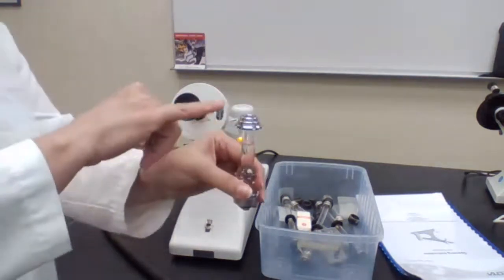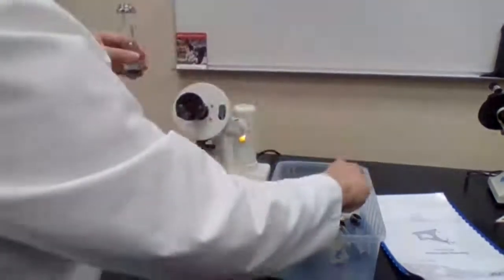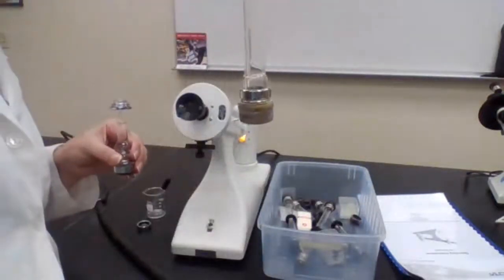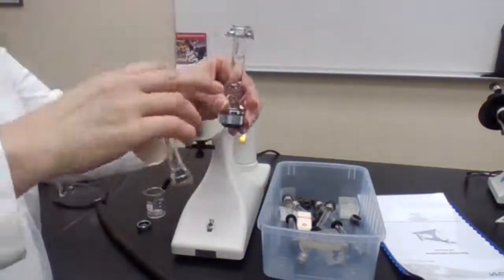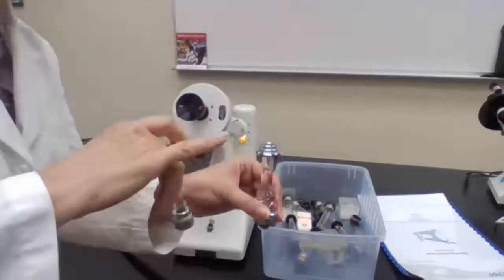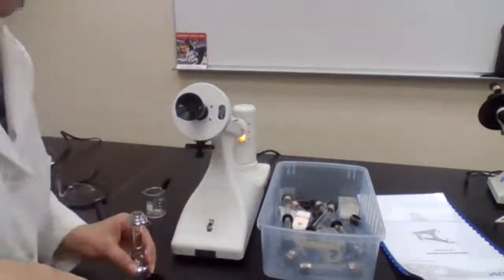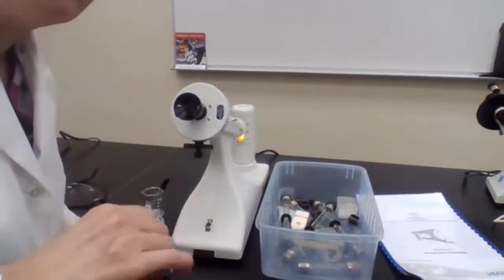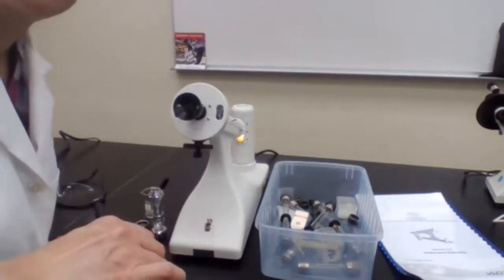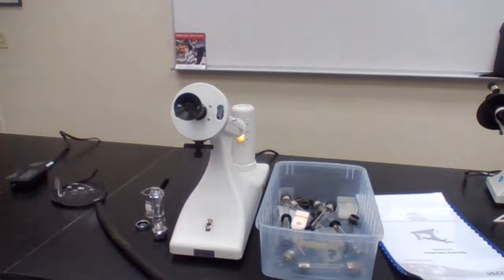Going to have to add more methanol to fill it up, because when I wrote the procedure, it was based on this cell, 7.4. This one has this bubble here. It takes more, so I'm going to change this to 10 milliliters. So I'm adding 2.5 more of the methanol. Please change that 7.4 in the procedure part to 10 milliliters for your record.